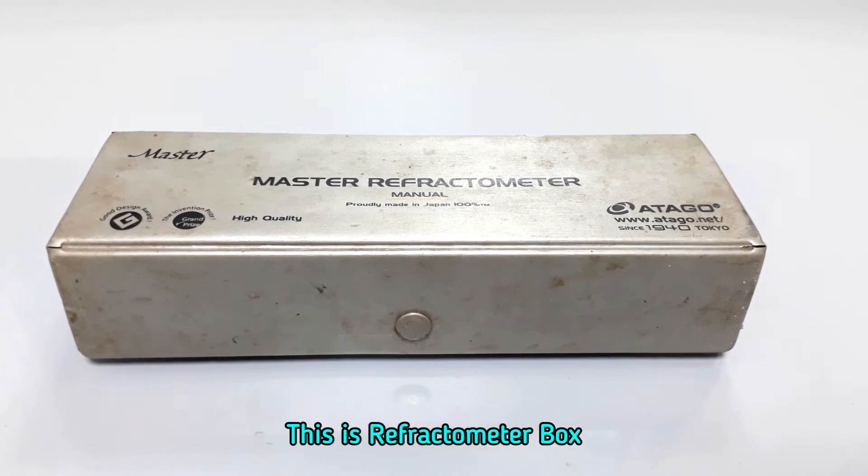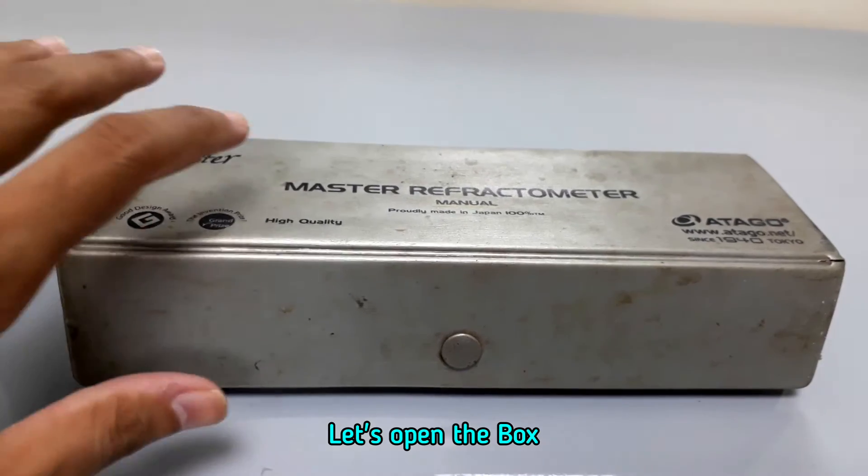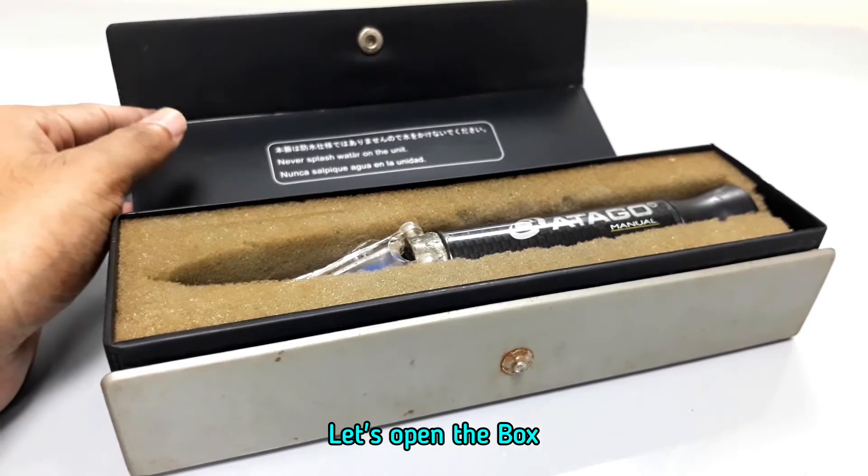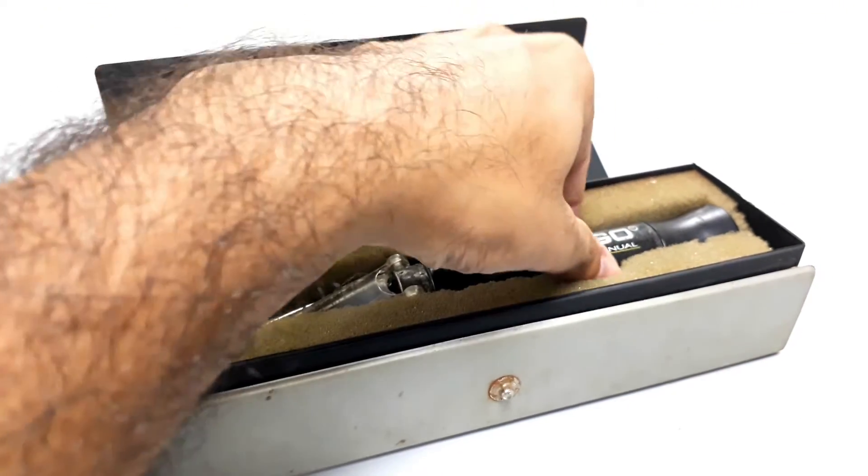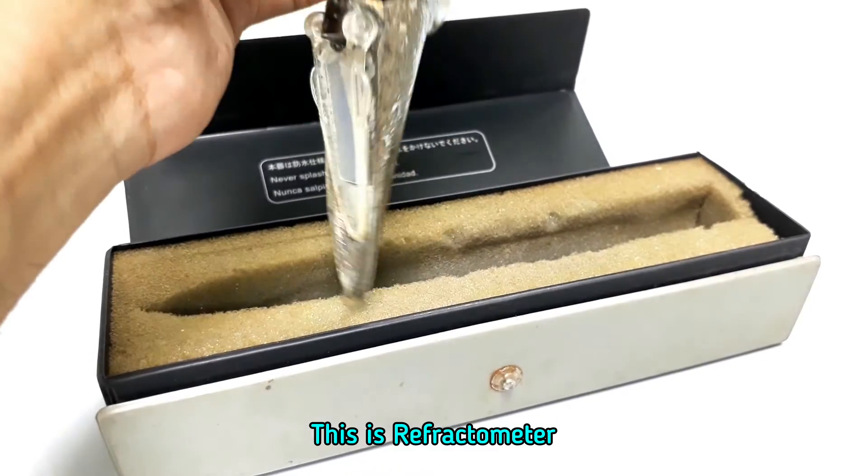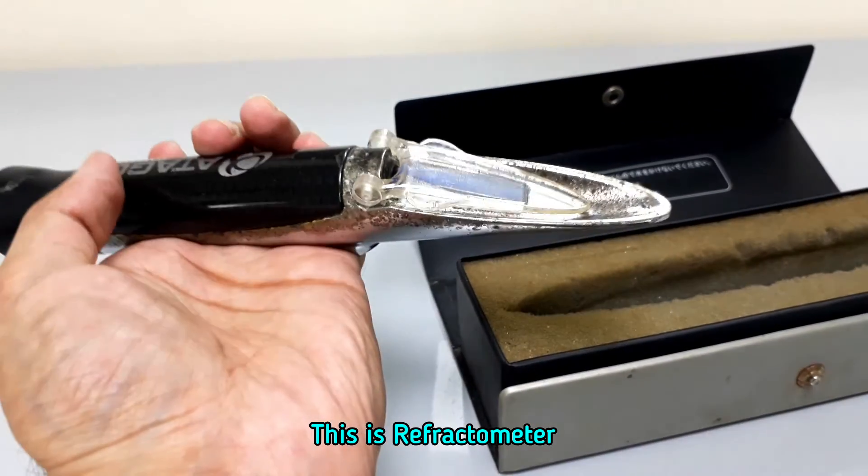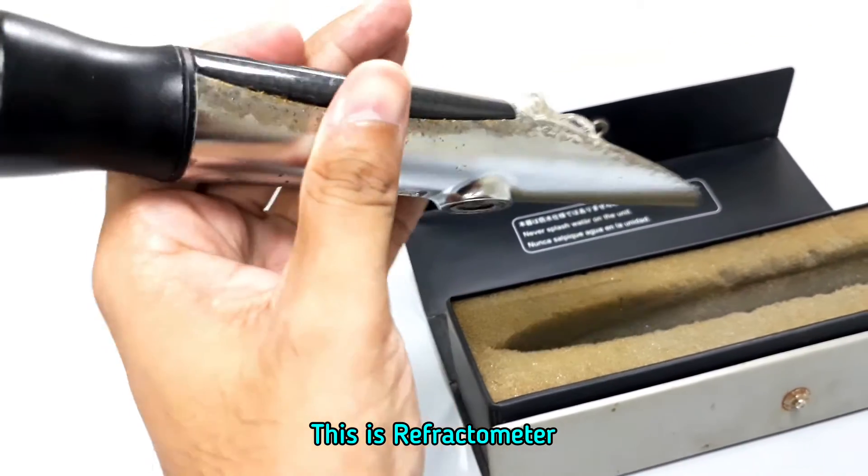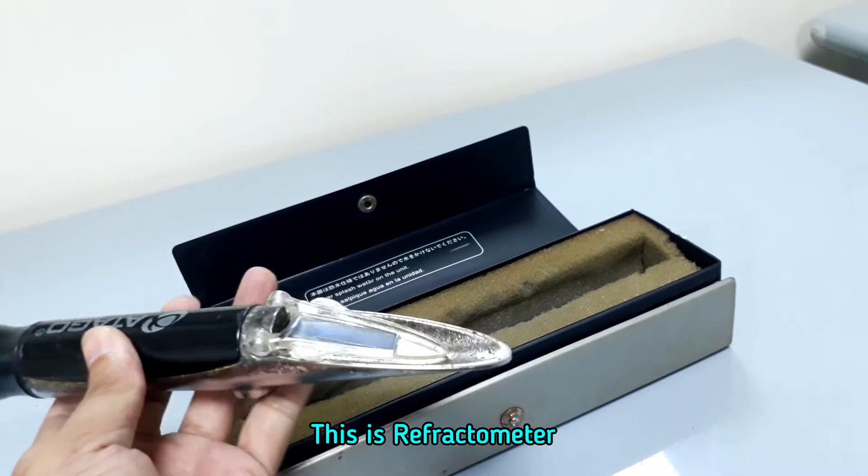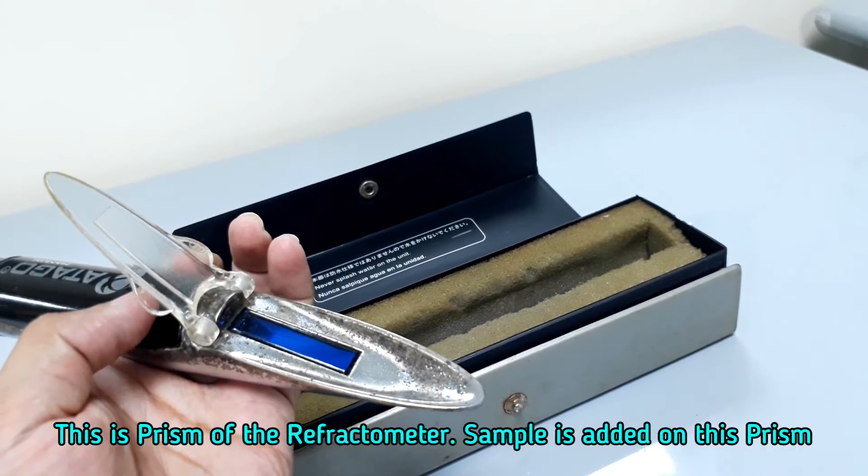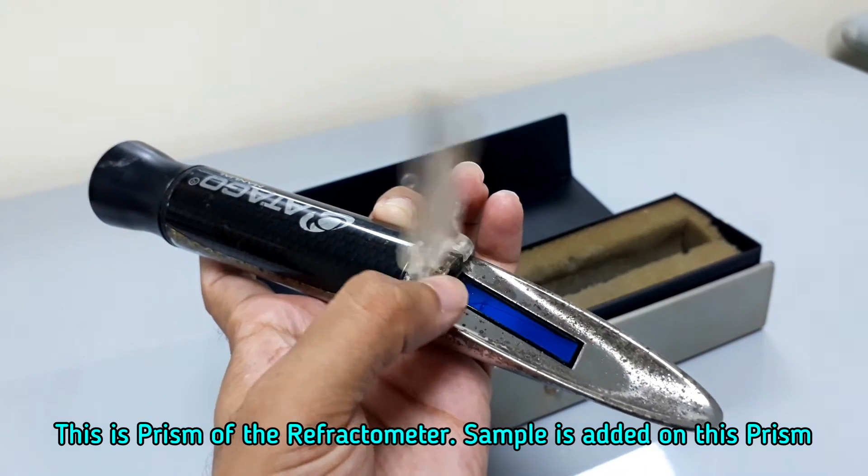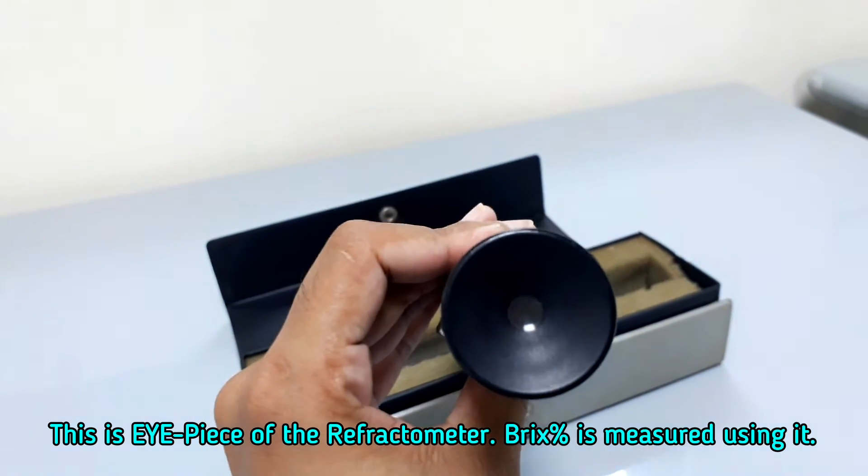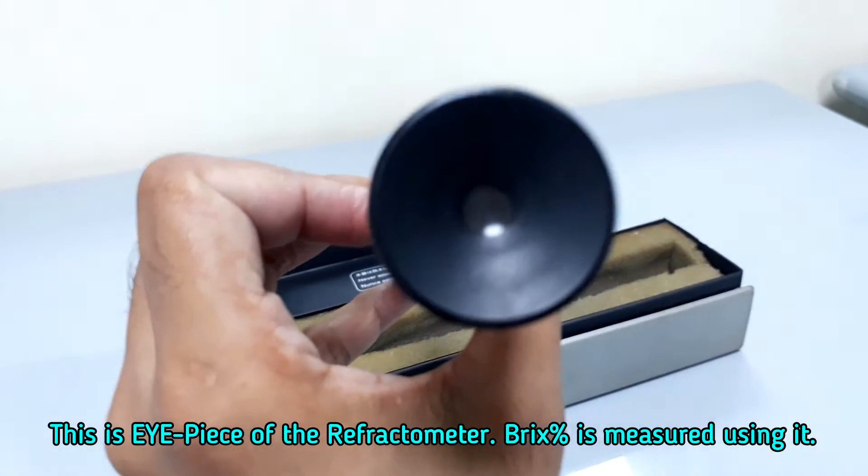This is the refractometer box. This is the refractometer. This is the prism of the refractometer. Sample is added on this prism. This is the eyepiece of the refractometer. Brix percentage is measured using it.